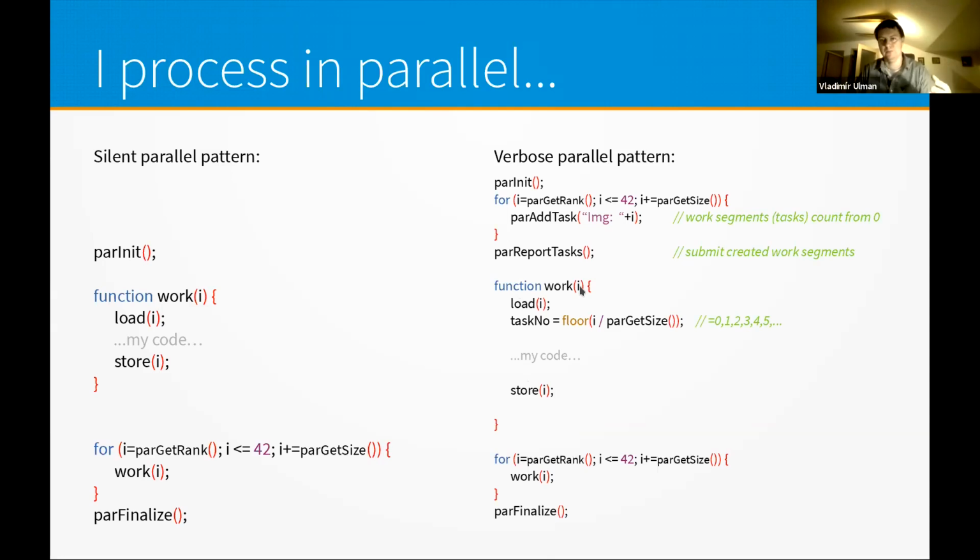We have somehow figured out how to map the program into numbers. But when we want to update these progress bars, we are also referring to them with a number, and the sequence of numbers is different here. So we basically need to translate from the sequence of i's into the sequence with which the progress bars are represented. And the sequence with the progress bars is easy.